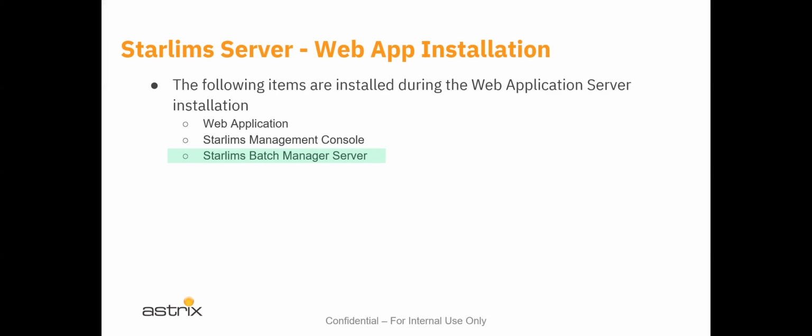In that process, a batch manager server might recognize that the sample has arrived and automatically assign tests, automatically assign queuing for instruments to let the instruments know, hey, we received a sample and we're expected to send this over to you, and we're going to set a status on that sample indicating that it's been logged and/or in process. So a batch server handles all of that type of traffic. And it's a separate machine and configuration altogether.